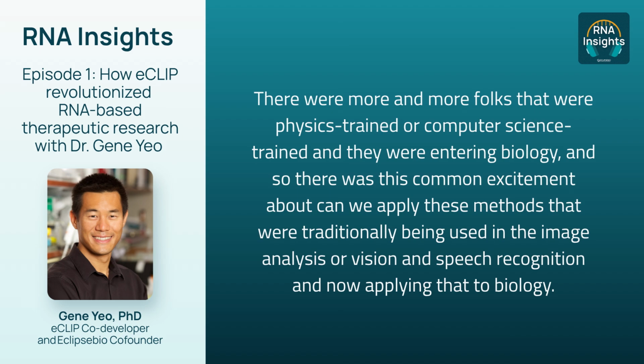And so the original developers of the CLIP technology at Rockefeller also had made other advances to improve the efficiency of the technology. And we spent a year running hundreds of experiments with these updated methods. But again, they were very sensitive to the quality of the antibodies, the choice of RBPs. And so then we got worried that we will not be able to complete our mission in the grant.